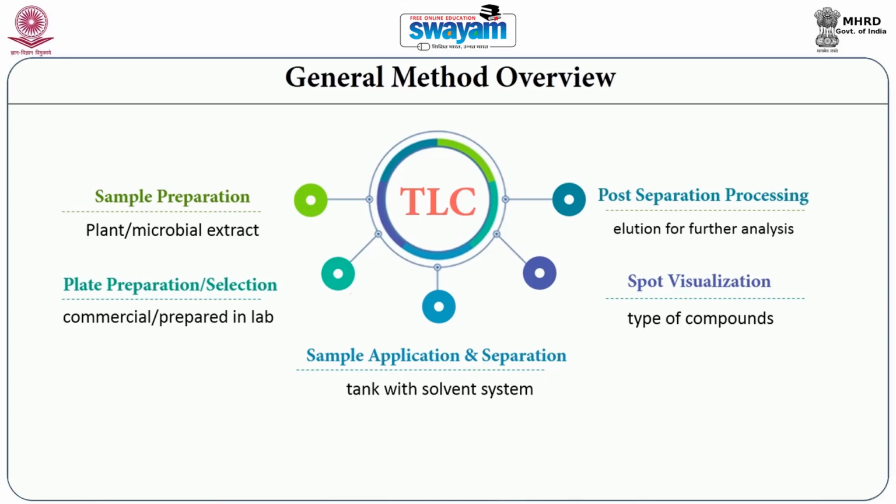So to analyze the fatty acid components of the different kinds of lipids present in HDL, TLC is the first step, which is subsequently combined with another chromatographic process to get a more accurate picture of the individual fatty acid composition.